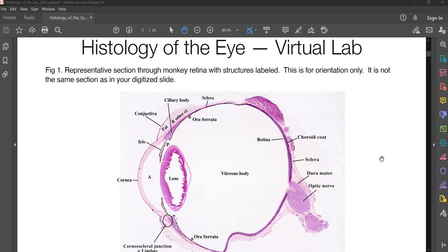Hey everyone, I've got a quick video here for you to review some eye histology. We have two slides to look at: one of them is the monkey eye and the other one is the human eye.